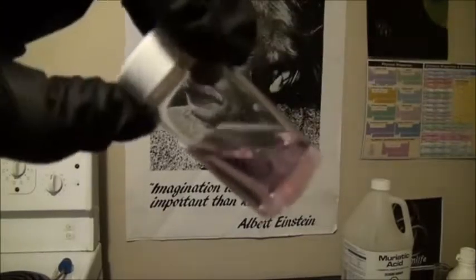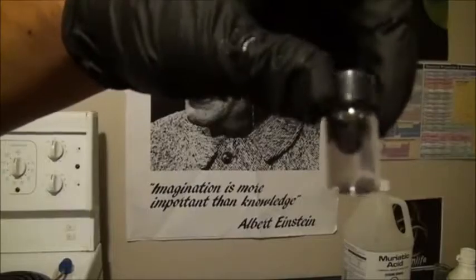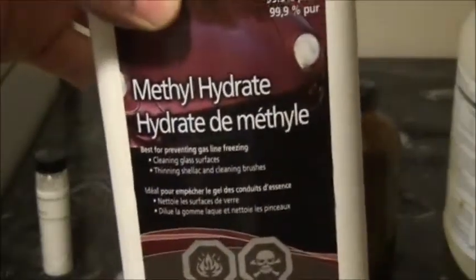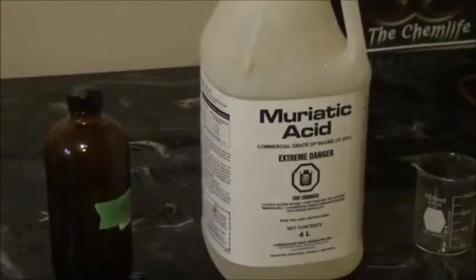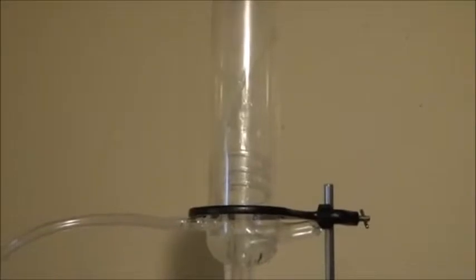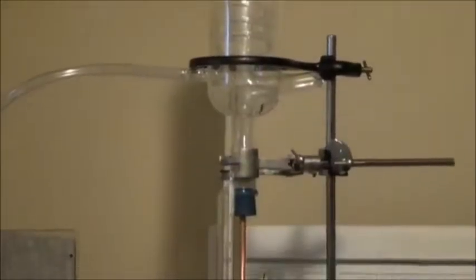This simple organic synthesis produces a compound used in aromatherapy. For this synthesis, we'll need acetylsalicylic acid, methanol or methyl hydrate depending on where you buy it, sulfuric acid, and finally hydrochloric or muriatic acid. You will also need to have a simple reflux setup.